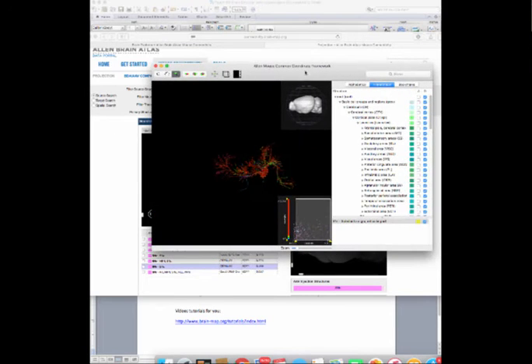What you're going to open up is a map of all of the connections that span out from your region of interest. You can see this spot of dark red squares, and this is where the tracer was actually taken up by the cells. You can then use the right click to move around in any direction to see different angles of this tracer. You can rotate it. Even though there's this extensive connectivity everywhere, one helpful thing to do to pinpoint a connection is to look at the strongest connections and where most of the connectivity is going.